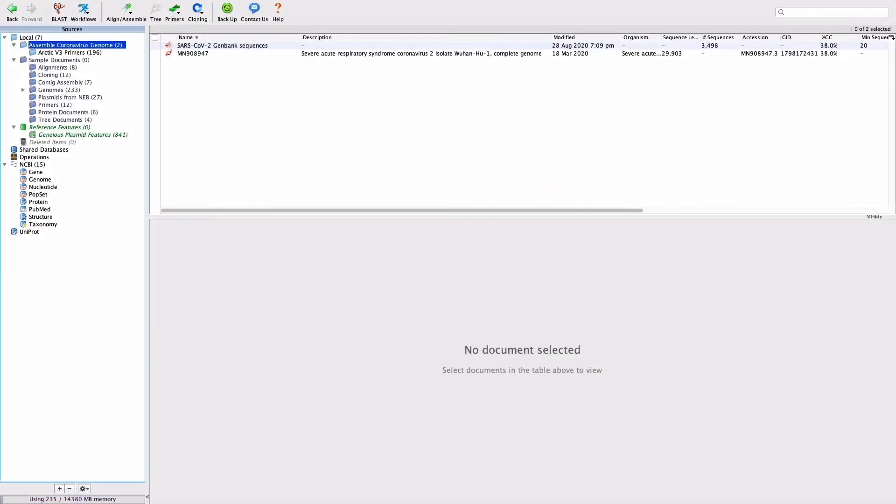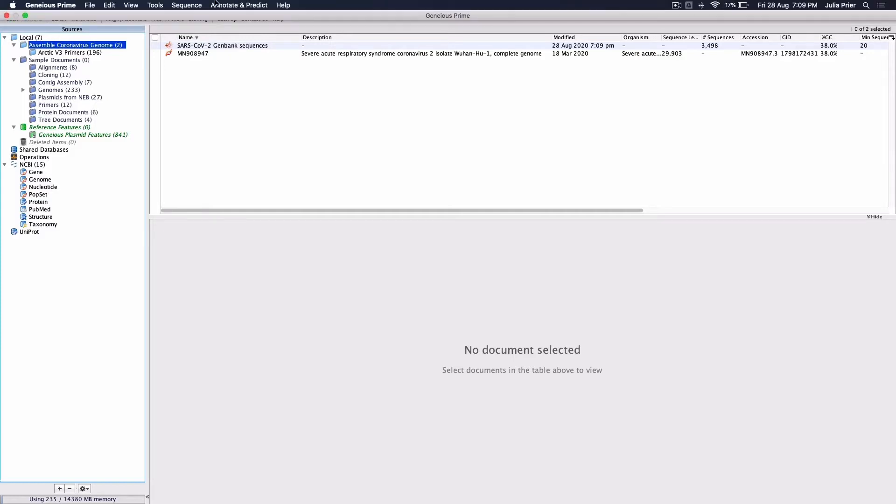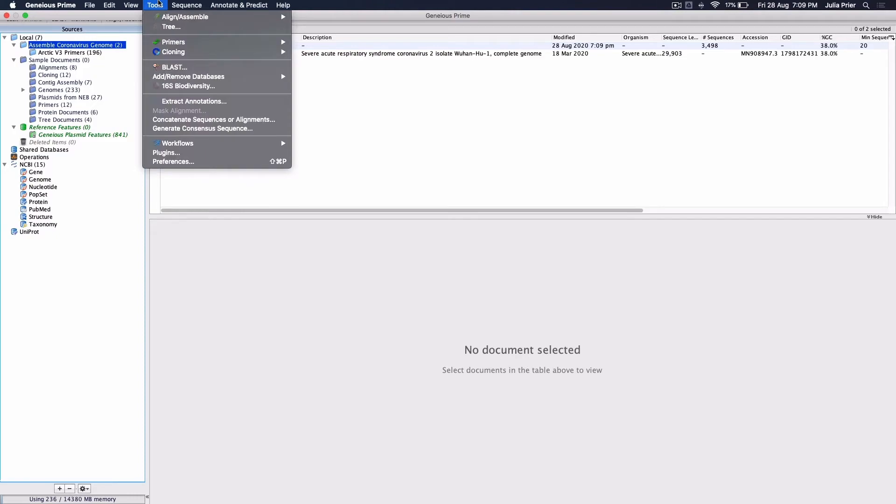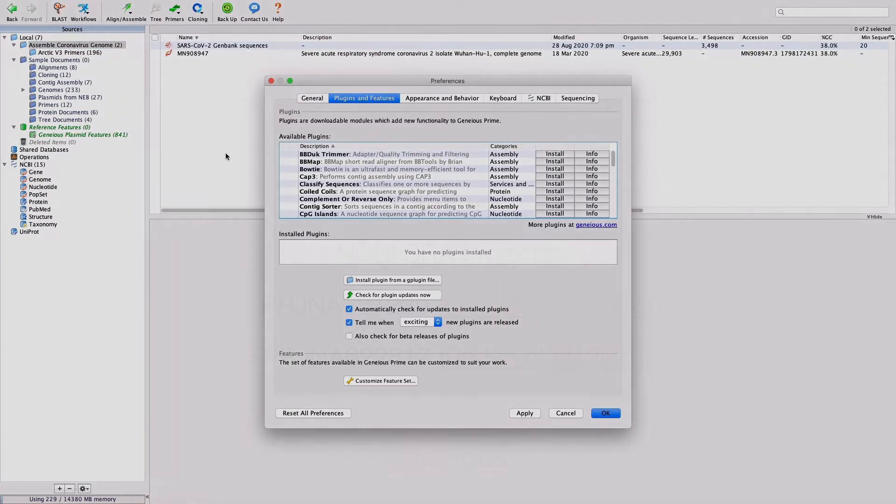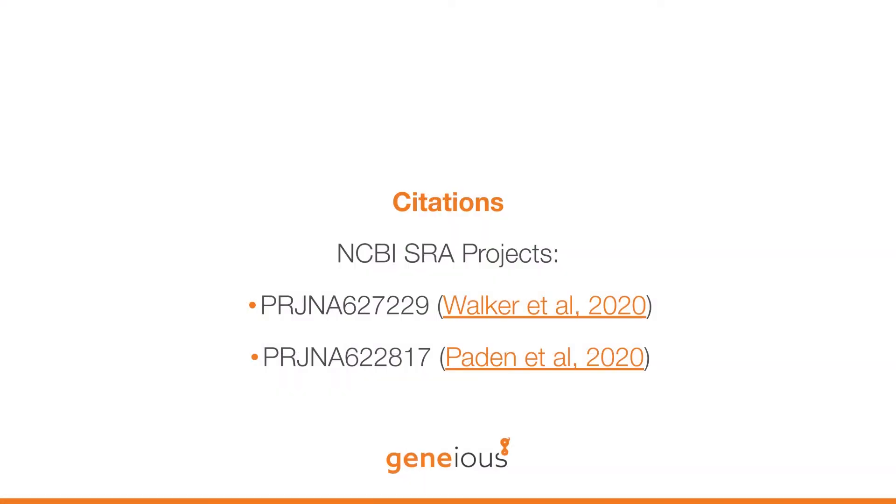This video outlines a workflow for the assembly of SARS-CoV-2 sequences from Illumina data. The workflow requires the BBDuk plugin. This free plugin can be installed by going to Tools and Plugins. This workflow has been tested on publicly available datasets from the NCBI SRA, and gives identical results to the iVar pipeline and the CDC analysis pipeline for Illumina multiplex PCR.